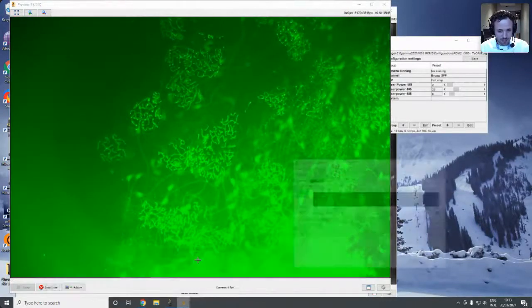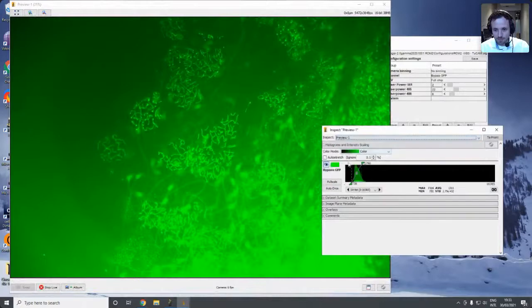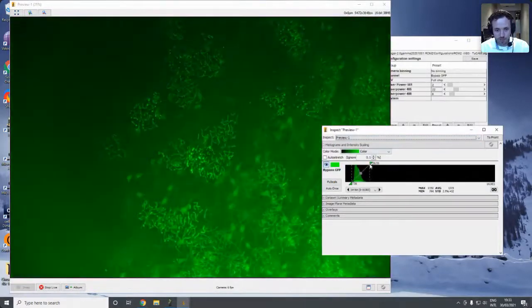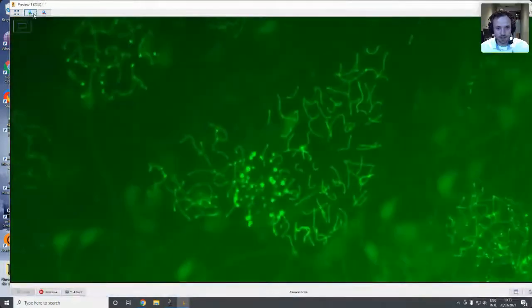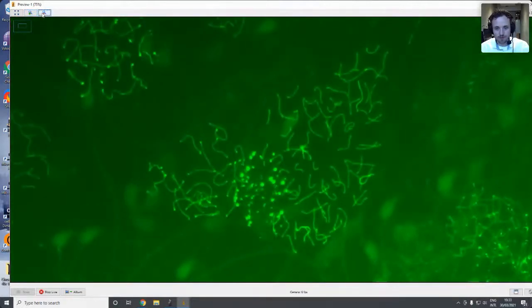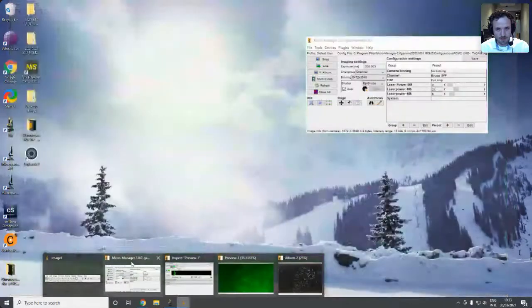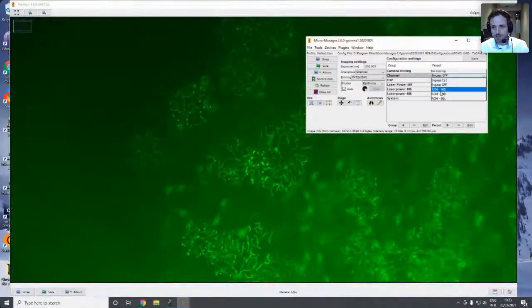So really you get to see much more biology, but at the same resolution. That's the big point that we want to make here. So here are the same chromosomes that I had in the 100x field in wide field mode. So this is not super resolution yet. So let's take this image as a reference and go again in RCM mode.